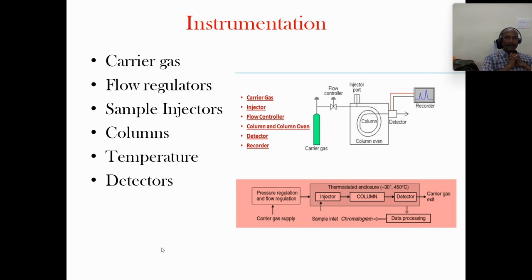Next, come to another important topic, instrumentation. In the case of instrumentation, what are the important components that are observed in this case?